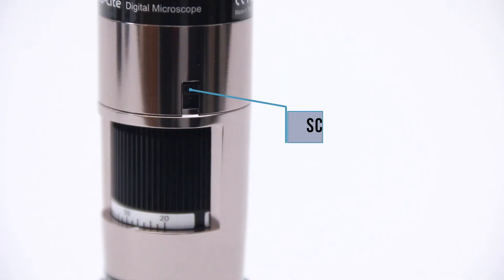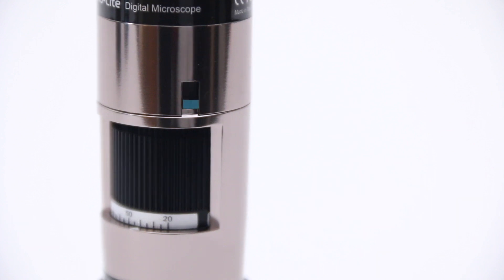Next you'll see the scroll lock feature. Once you have the magnification fixed where you want it, simply slide this down to lock it in place and the magnification will no longer be able to be adjusted.